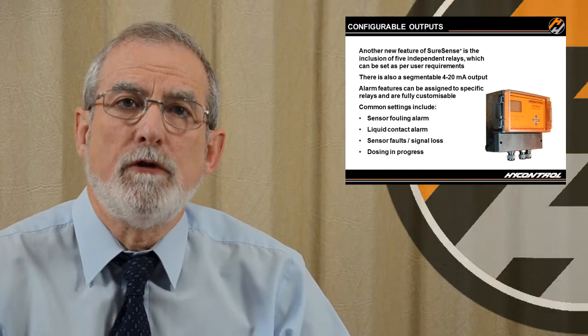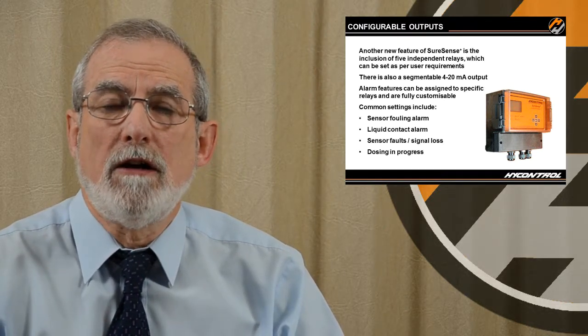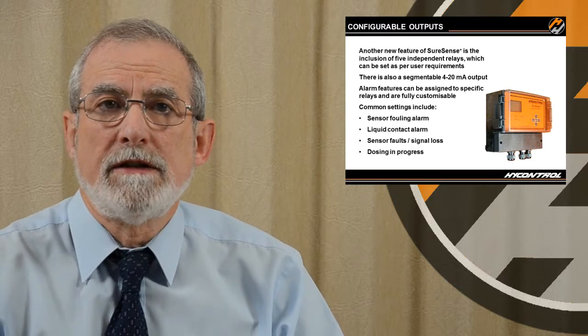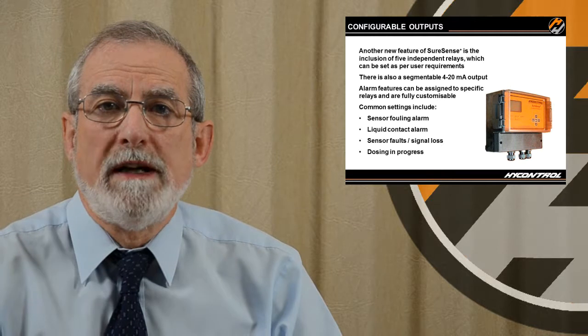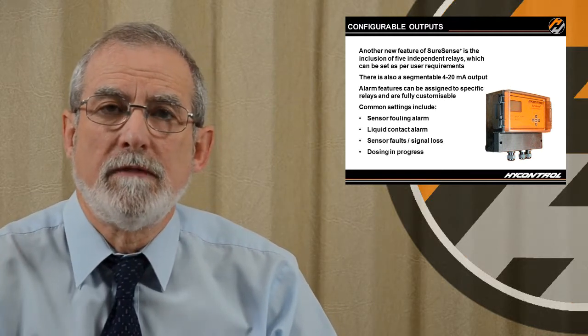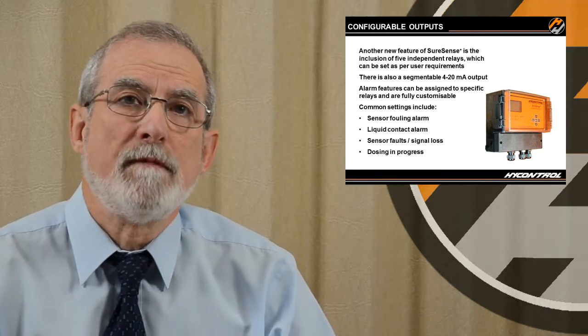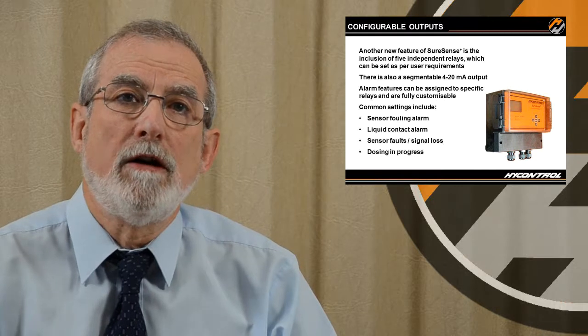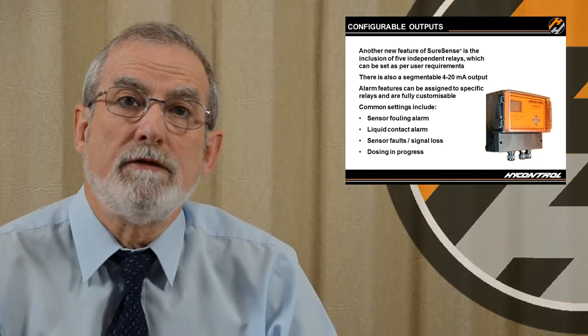The 4 to 20 milliamp output can also be used to indicate an alarm. So if there's an alarm situation, you can configure the 4 milliamps to fall below 4, which is an alarm state, or increase above 20, which is also an alarm state. So it can be used to indicate an alarm if you only want to use the 4 to 20 milliamp output and not use the relays at all, for example.